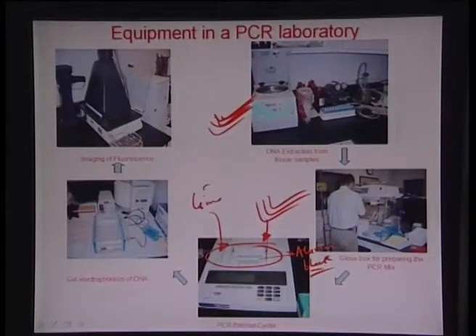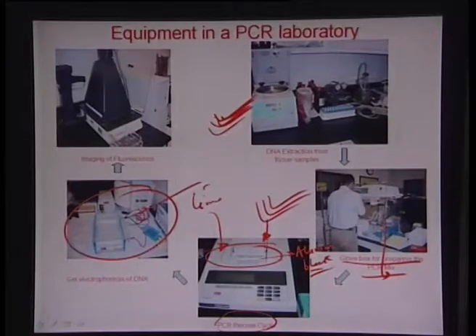It is in the range of some hours, and microsizing the PCR would prevent this huge consumption of time in a normal size PCR thermocycler. Such cyclers are actually about the size of a desktop computer. This is a sample preparation hood where a PCR mix and other DNA related sample preparation can be executed. This is how an electrophoresis tool would look. This is an electrophoresis bench used for gel electrophoresis, and this is a transilluminator and a hood that I have been talking about in the last slide.